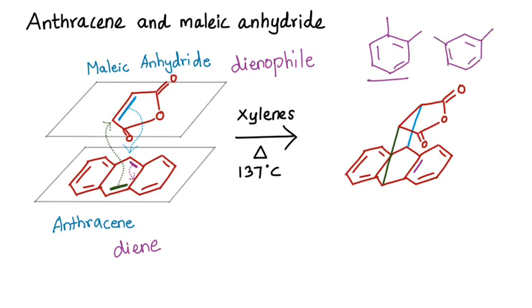So this is another xylene. Look at the substituent methyl group, it's on a different carbon. And there's another xylene. So ortho, meta, para, three different types of xylenes are mixed in the bottle, so we call it xylenes.